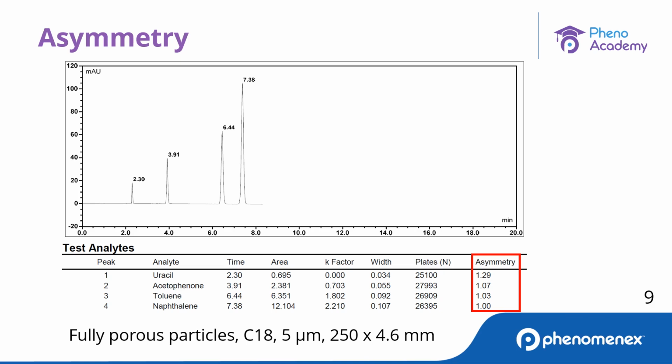And what is a good symmetry factor really depends on what you need. As long as peaks don't co-elute or integration is otherwise problematic, then you are okay. However, the worse that peaks front or tail, the broader they are, meaning that peaks could start overlapping, indicating that analytes are co-eluting, and that makes their quantitation less accurate.